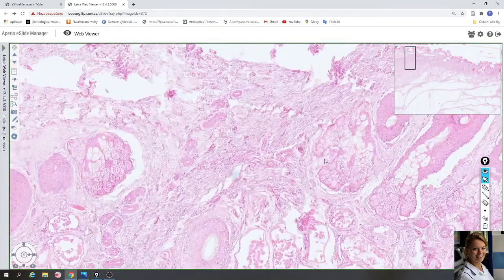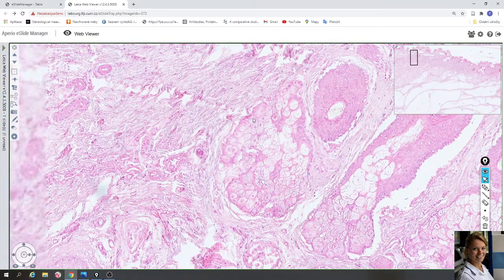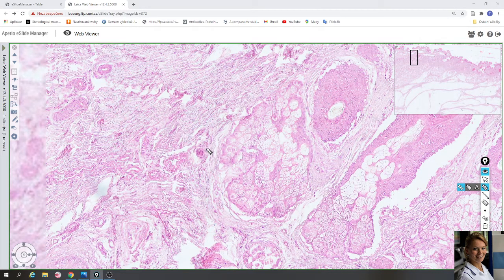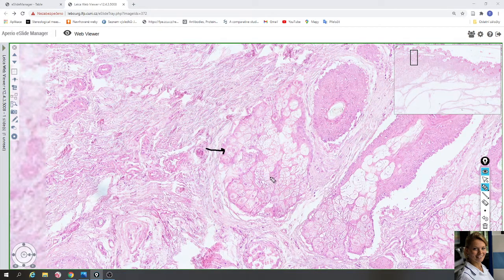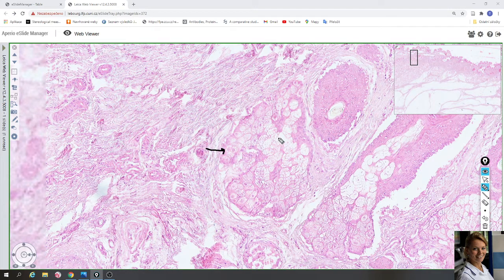The first is the sebaceous gland, which is associated with hair follicles. Here is a hair follicle, and here is an alveolus or acinus of a sebaceous gland. On the periphery of the alveolus are small darker cells that are gradually filled by oil. The sebaceous gland is a holocrine type of secretion — the cells full of oil are damaged and the oil is delivered to the duct and then to the hair follicle.